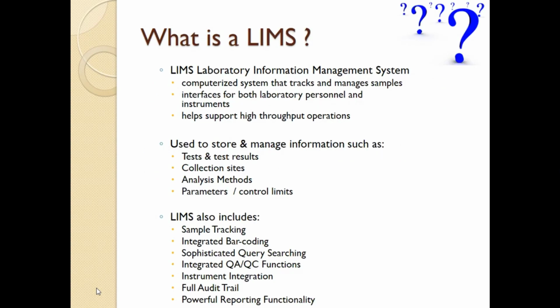So what is LIMS? LIMS stands for Laboratory Information Management System. It's a computerized system that tracks and manages samples through a protocol. It's an interface for both laboratory personnel and instruments. It helps support high throughput operations.